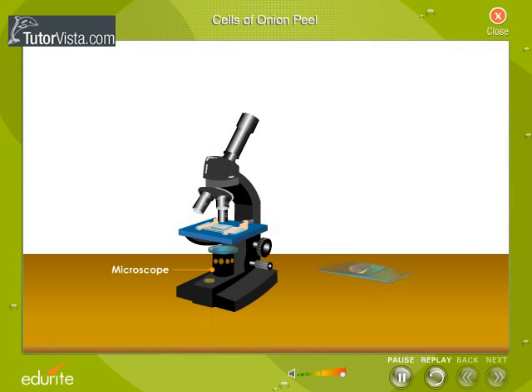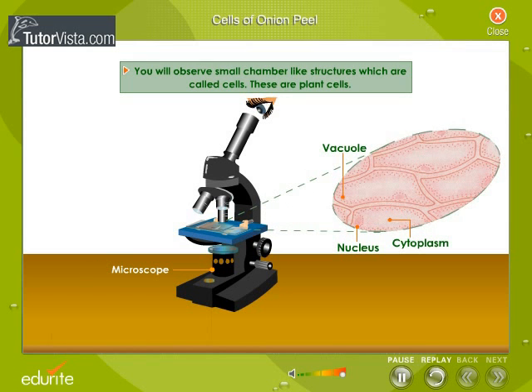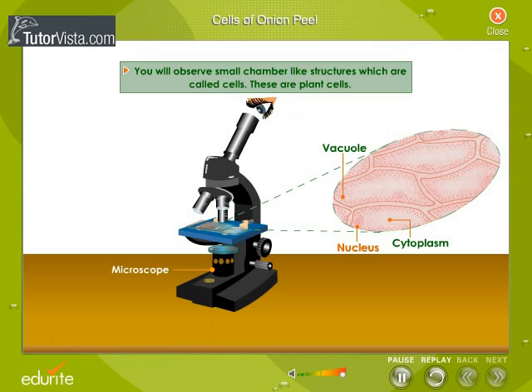Observe the slide under a microscope. You will observe small chamber-like structures which are called cells. The cells have vacuoles, nucleus, and cytoplasm. These are the onion cells.